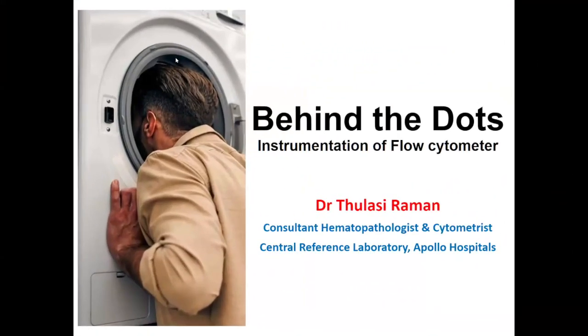So what we are going to do is peep our head into a flow cytometer and see how it's working. I want this session to be more interactive. We are going to see how a flow cytometer works, and that's exactly what I'm going to try to do. I want you all to get into the flow cytometer and see what's happening inside.